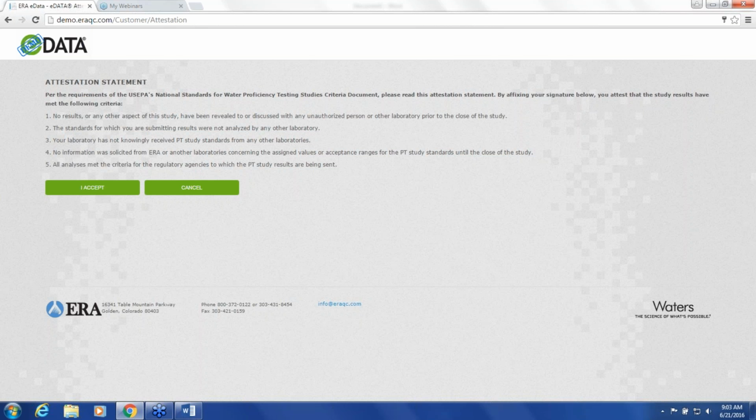Who should be attending this webinar? We're targeting corporate QA managers for network laboratories. And if you are a corporate QA manager for a multi-lab organization, great, we're reaching the right audience. If you are not, you are certainly welcome to stay, but you may find this talk kind of boring.